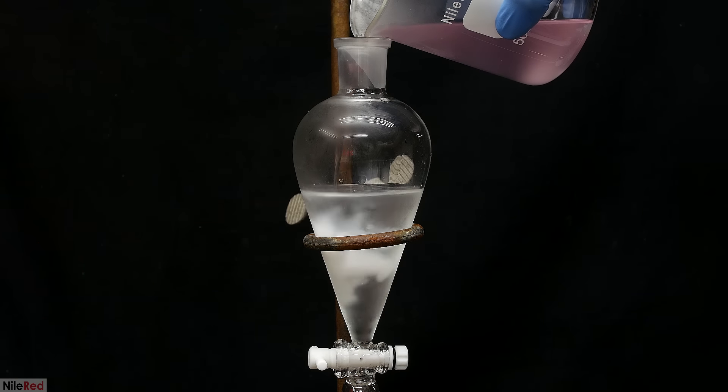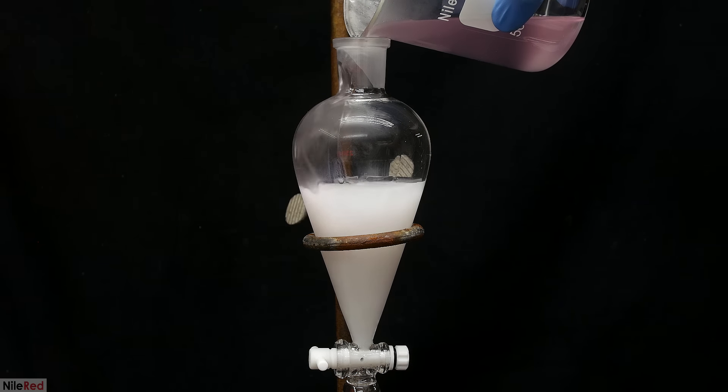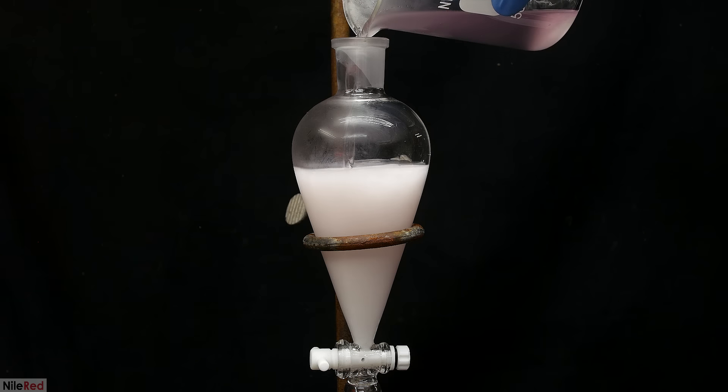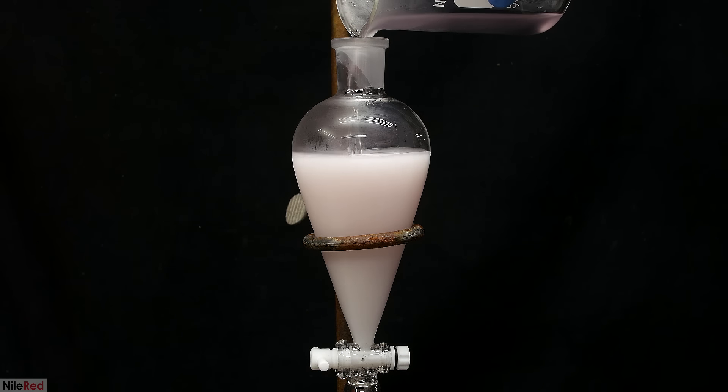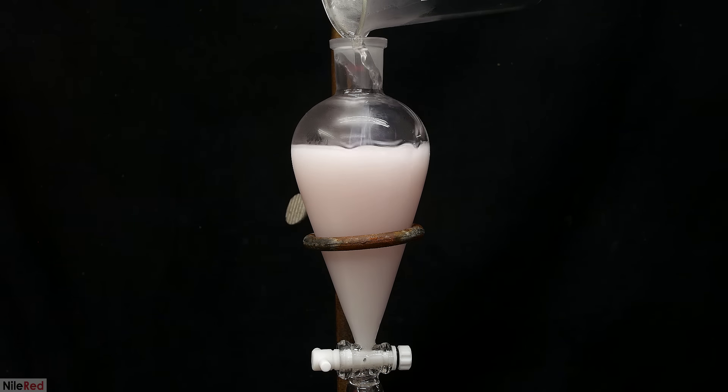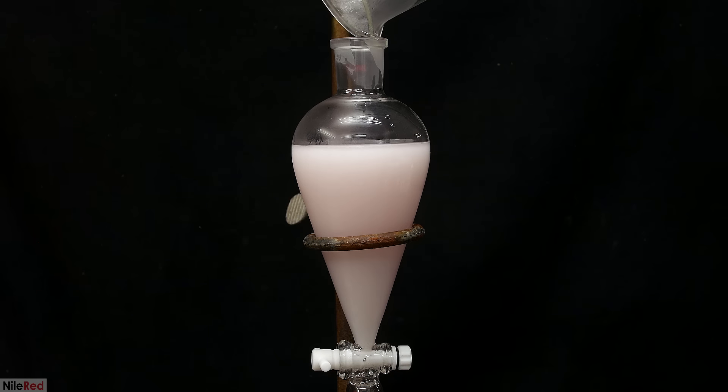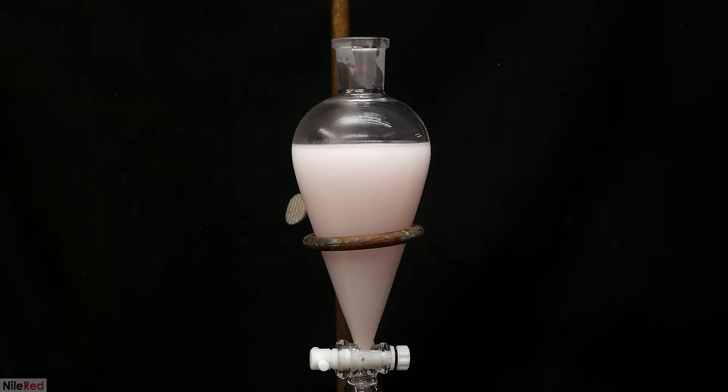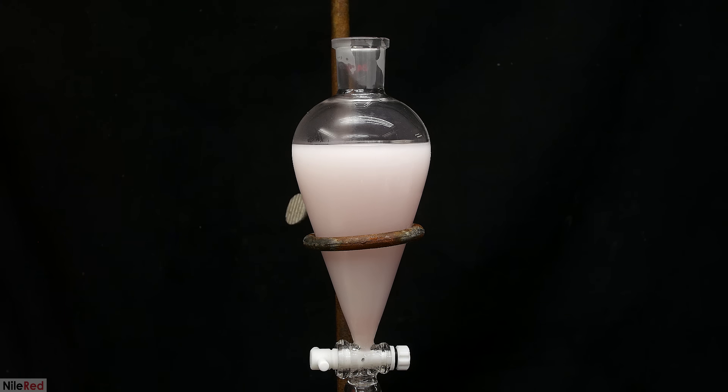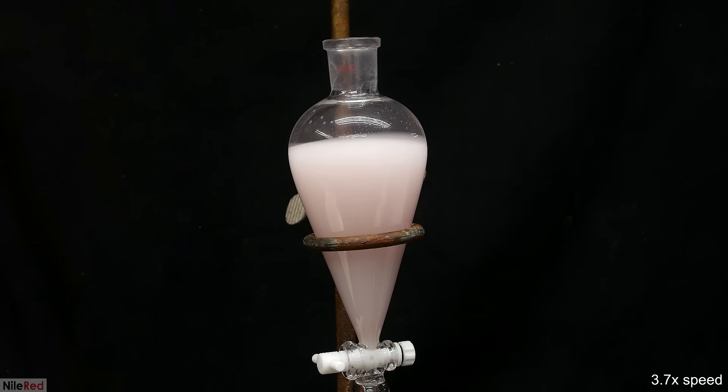While still hot, it's transferred to a separatory funnel that has 100 milliliters of ice cold water in it. The moment it's added, a lot of white precipitate falls out of solution, and this is just unreacted starting material. The wintergreen also separates out and sinks to the bottom, but you can't really see it here. To really mix things around, the separatory funnel is capped and shaken, and then it's put back on the stand, and I wait for the layers to separate.